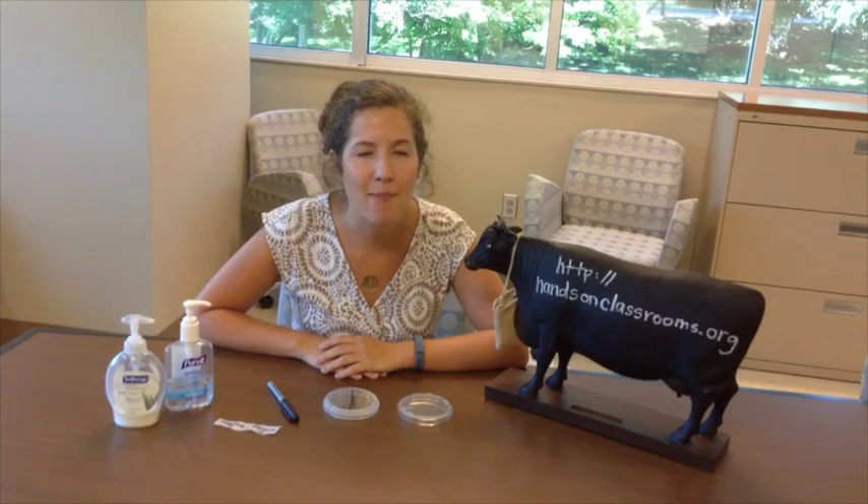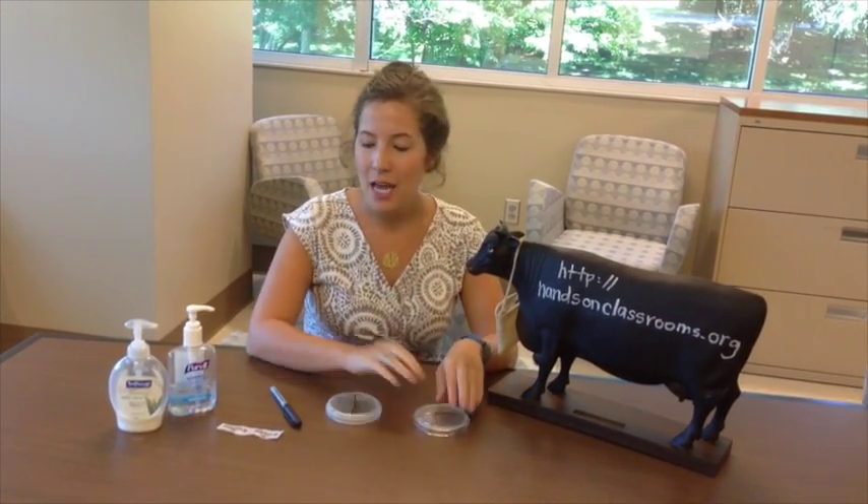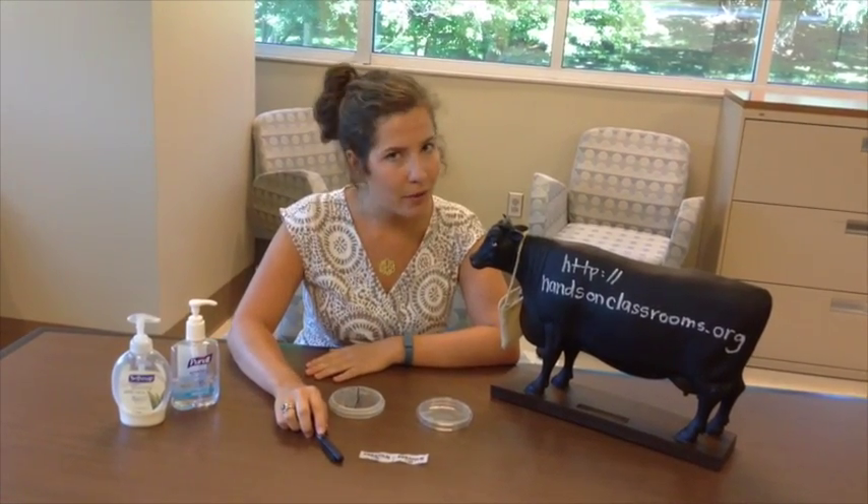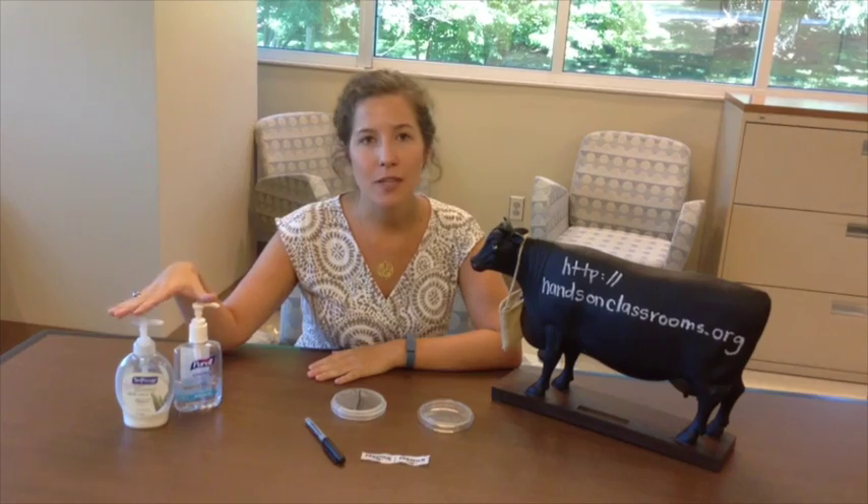Hopefully this will help combat a lot of the common issues and mistakes that might happen in the classroom. For your supplies, you'll have an agar plate, a slip of parafilm, a Sharpie that you'll probably share with one of your classmates, as well as your different treatments.